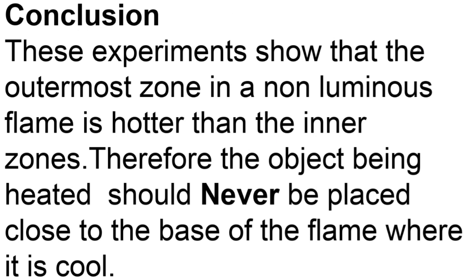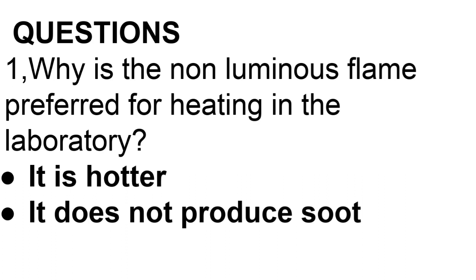Now, let's look at this question. Why is the non-luminous flame preferred for heating in the laboratory? So from what we learned in the first experiment, whenever the non-luminous flame is used for heating, the water boils faster, and also the apparatus being used for heating remains clean. So those are the two reasons why we prefer using the non-luminous flame for heating in the laboratory.